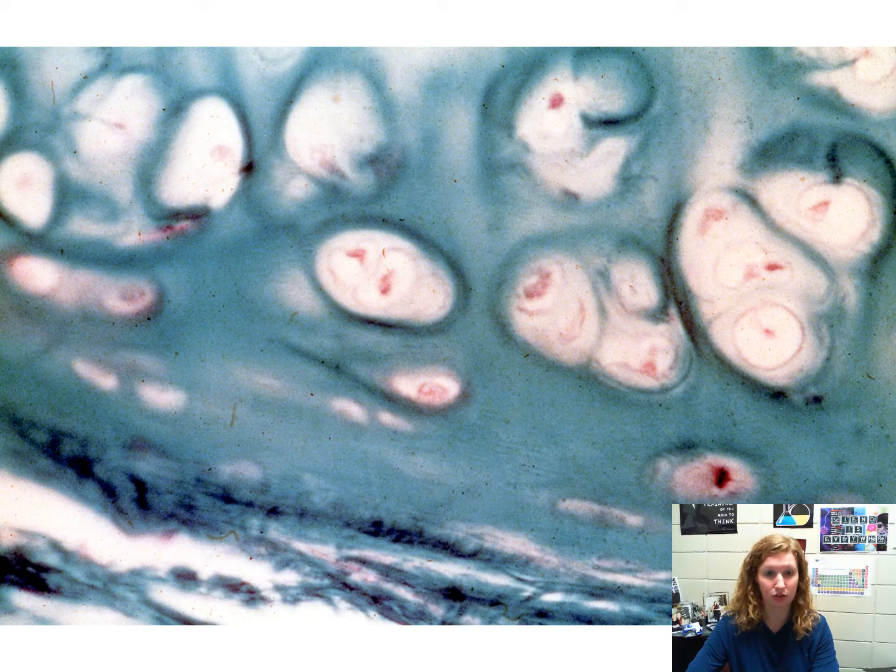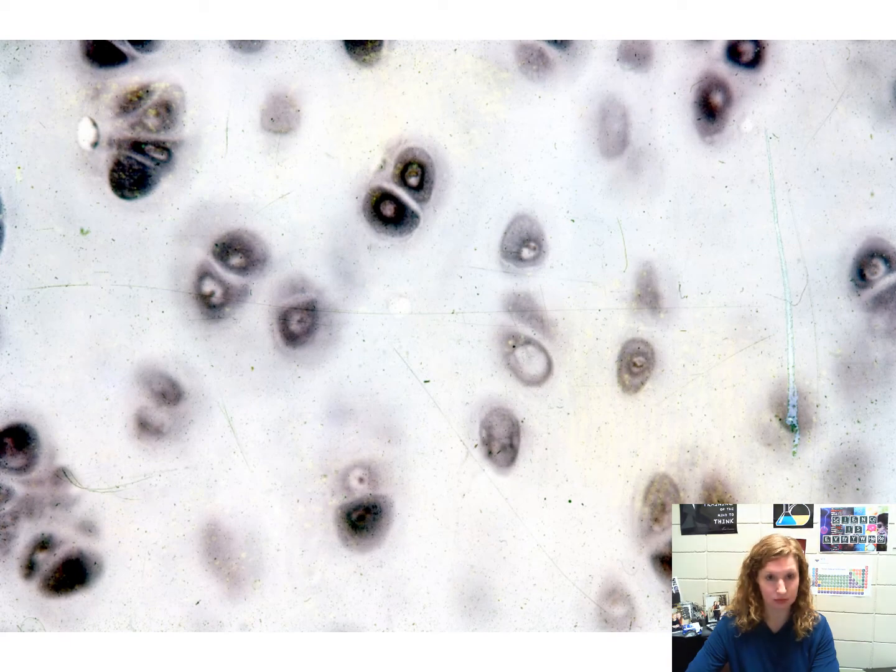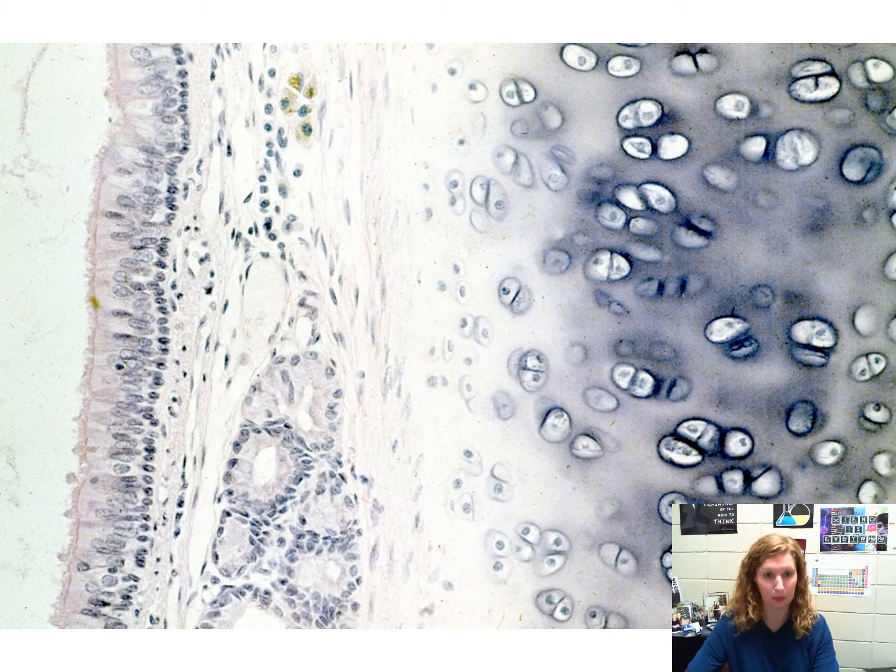Hyaline cartilage. This is cartilage of various types, mostly located to the right side of the slide.